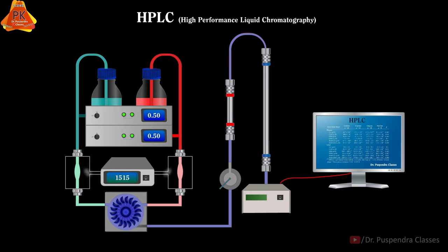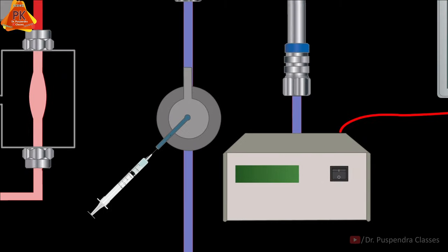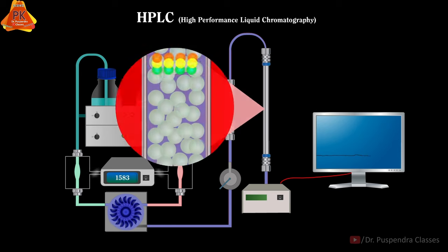In this condition, the blank mobile phase will run for at least 10 minutes, which gives proper conditioning of the HPLC instrument. Now we will inject the required amount of sample through the sample injector by the help of a microsyringe. After injecting the sample, it will pass through the guard column, then it will enter into the analytical column which contains the stationary phase.